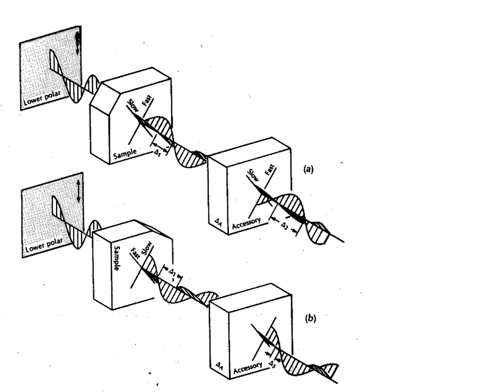So the split light ray will lag behind so that the upper right ray lags, but in the accessory plate the opposite happens and it's able to catch up essentially to the ray that had previously been the fast ray. The retardation between the two rays has now been reduced. It could even be reversed. The one that had previously been slow could now catch up and pass the fast one, so it could become the fast ray. And the lower order interference colors are then observed.